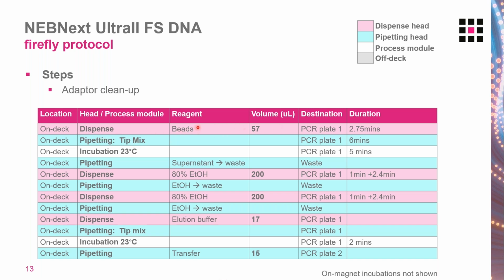In terms of protocol development, we found that after the addition of beads to the reaction plate, the well volume is quite high. It's just over 120 microliters. We found that mixing on the shaker at this point does not give us a good mix. We needed to tip mix. So we developed a really nice thorough mix sequence.